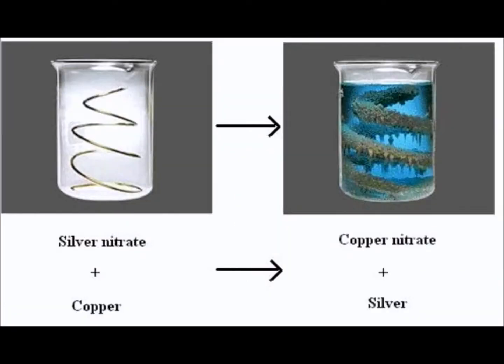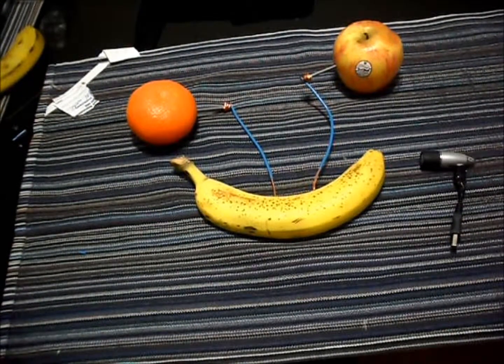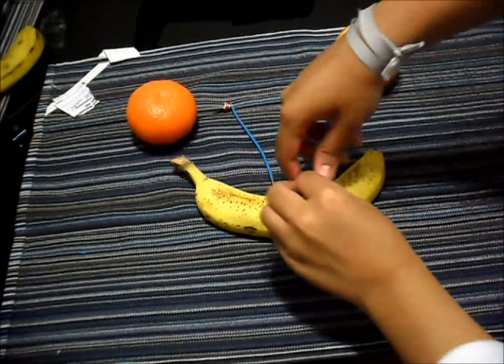Second, the metal atom on the surface may lose N electrons to the electrode and enter the solution as the ion, meaning that the metal atoms are oxidized. Now, we will plug a simple USB light directly into the banana between the 2 acting electrodes.